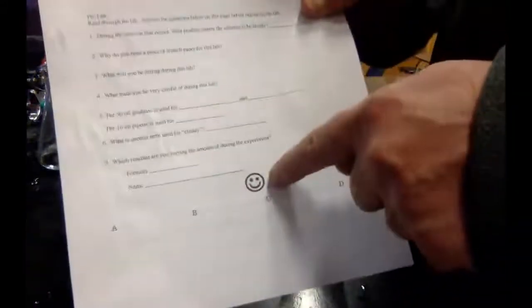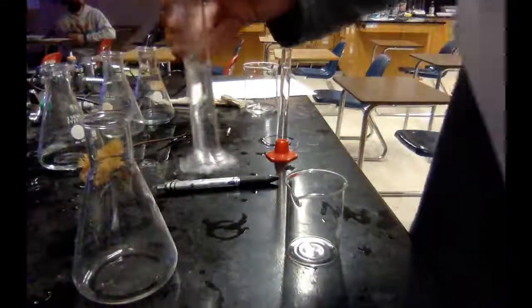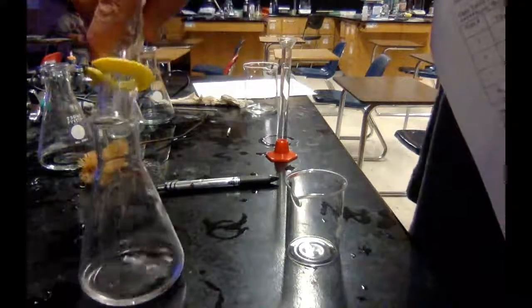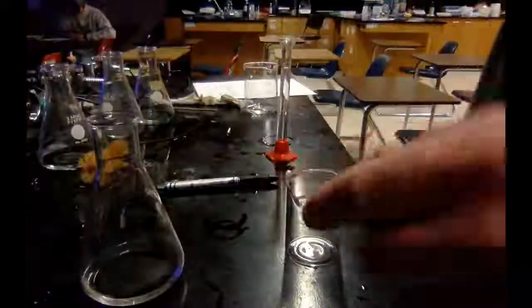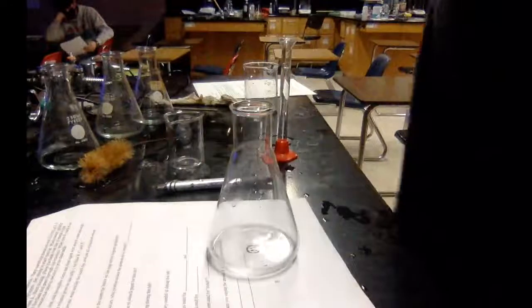So on this right here, you will have A, B, C, and D. The one thing you can do is do all your thiosulfate first and fill these up. You'll want to probably mark these as A, B, C, and D, right? And then you're going to have this smiley face right here, and you're going to use that to look through.